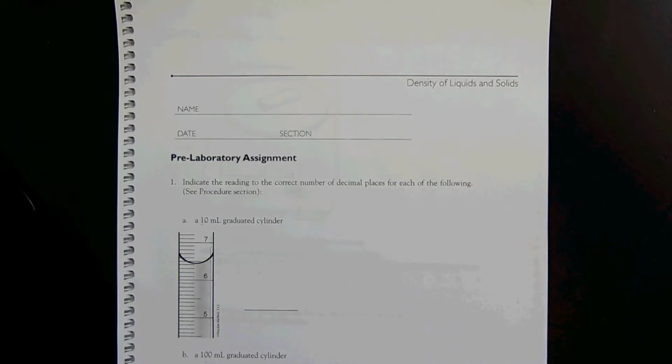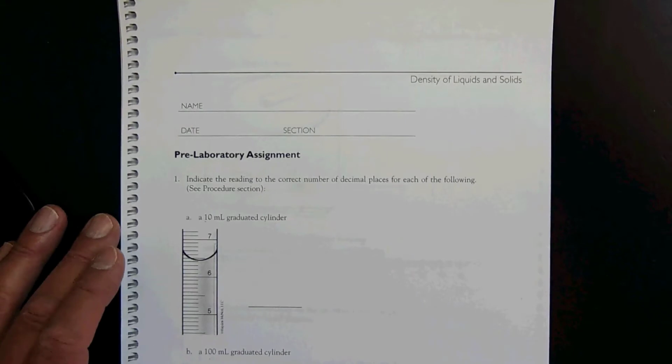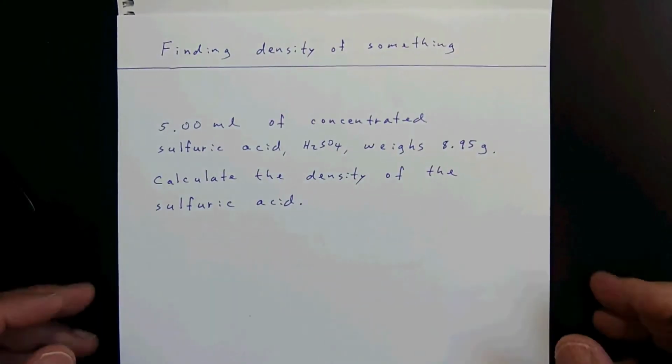Now, what I've done is I've gone and made modifications to the report sheets. I'll be going through these, showing you how to fill them out, and hopefully it'll make it a whole lot simpler for you. But before we talk about the report, let's talk about density calculations in general. You got to get pretty good with density. It's an easy one.